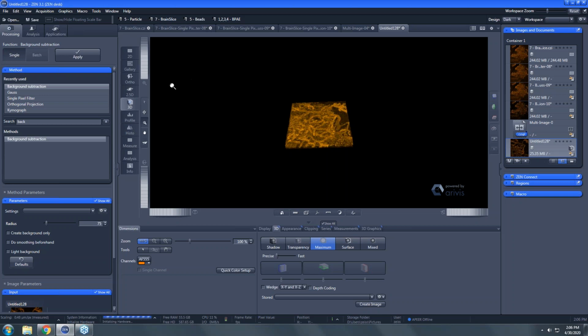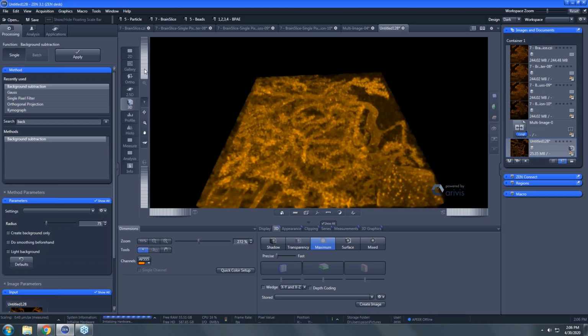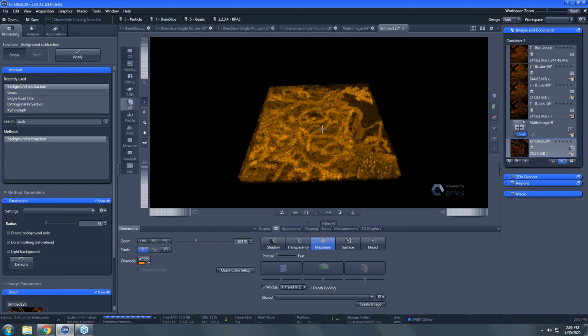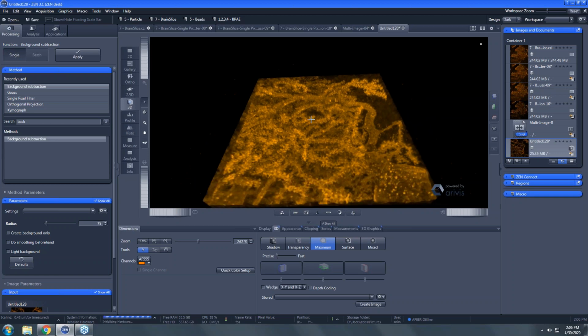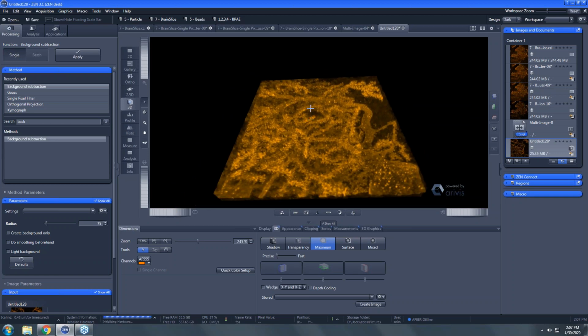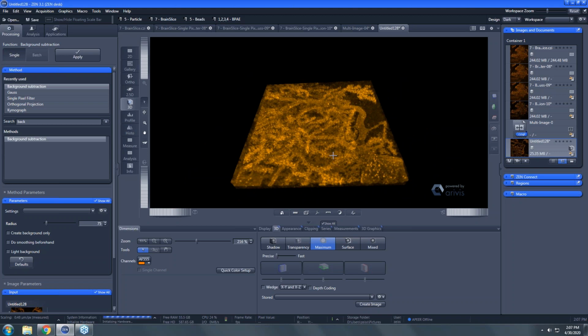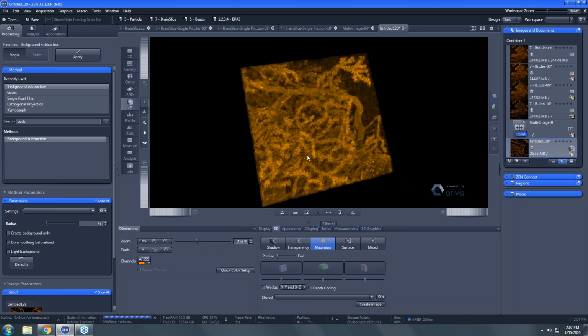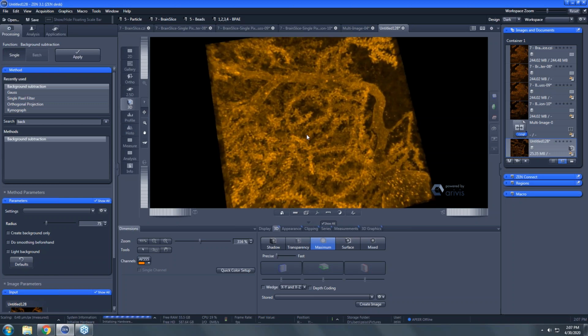Sure. The way that I usually use, in part so I don't have to switch tools, is this little zoom bar here. That allows me the most control. You can also use the mouse wheel. Yeah, it wasn't going, so I thought maybe it had to do with just my connection. You probably just have to click in the image once, or maybe we had the wrong tool selected here. That's possible as well.